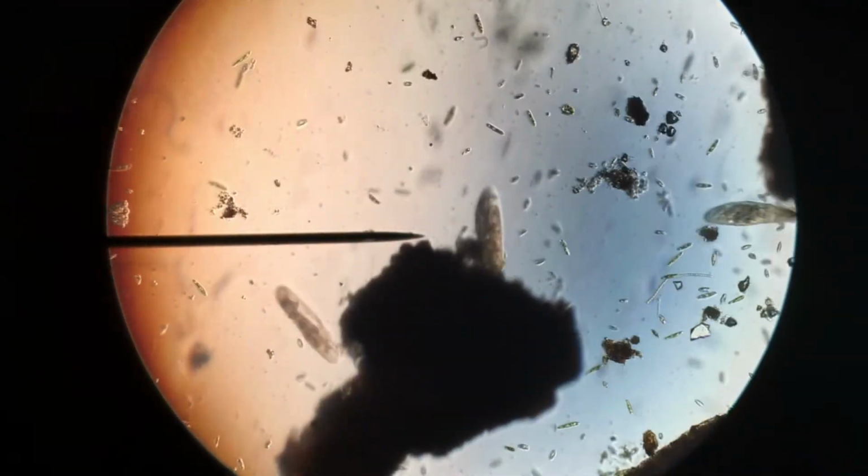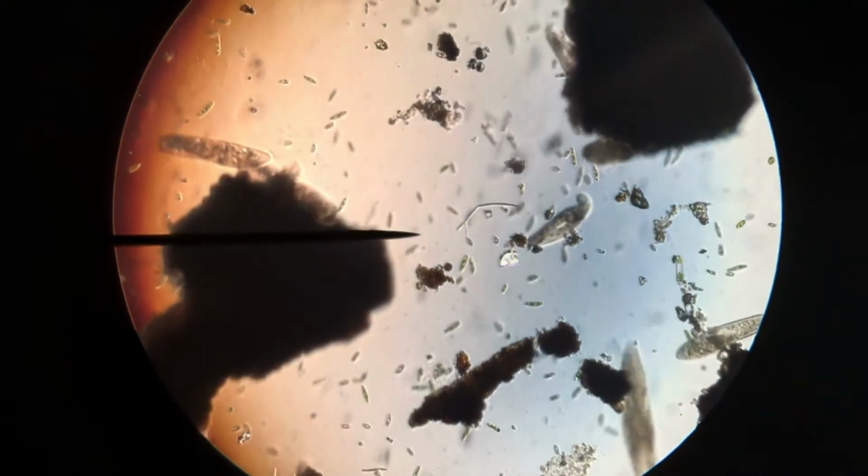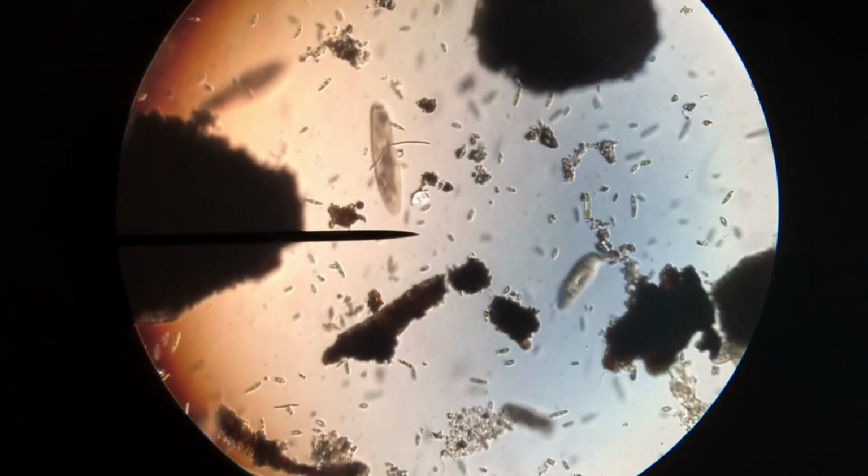Okay, for the last little bit of this, I'm going to see what we can get at a higher magnification.